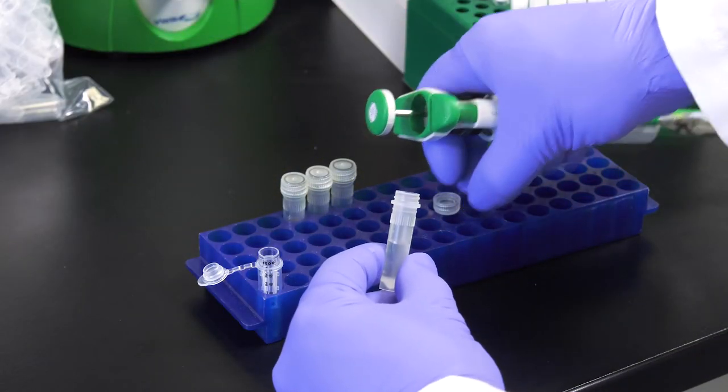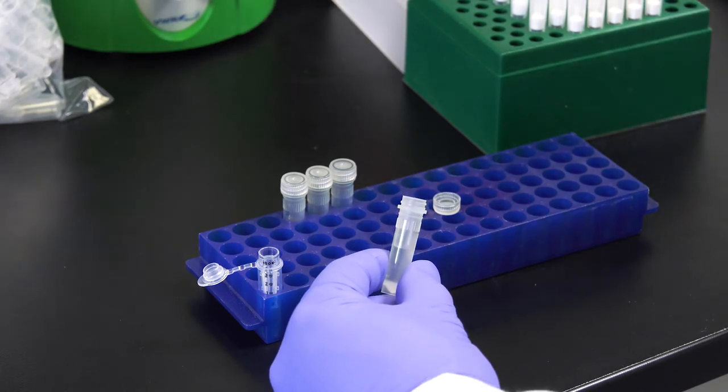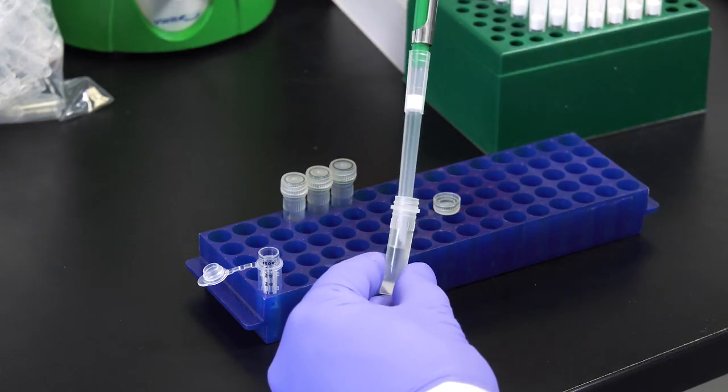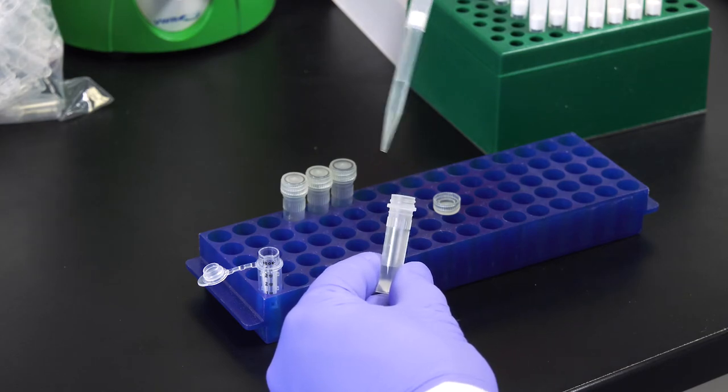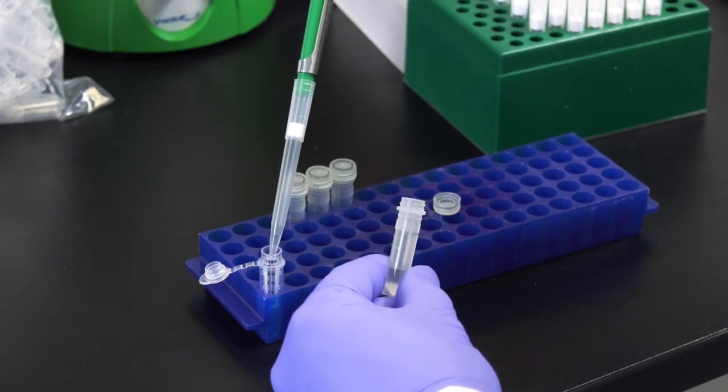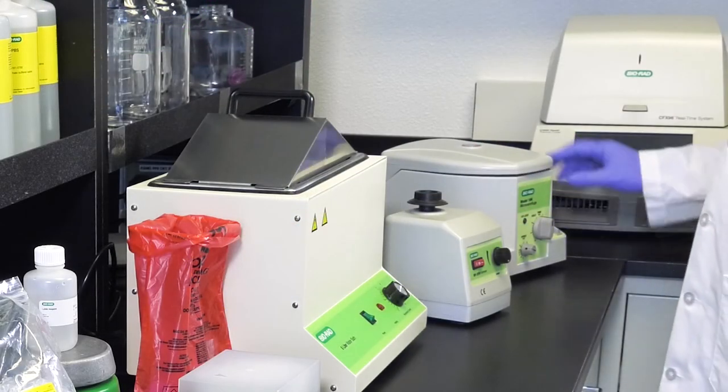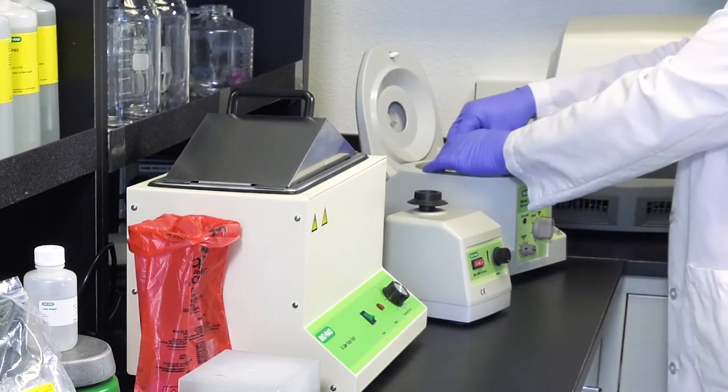Place the purification column in a collector tube and add 500 microliters of the supernatant to the purification column without vortexing the lysate. Seal each column with the collector vial cap. Centrifuge the purification column for 10 minutes at 6000 times G.